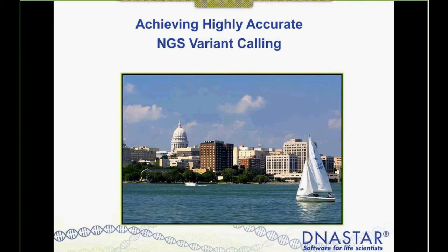As a starting point, though, I'll give some background to DNASTAR as a company, and then we'll go into kind of what the workflow is, and then we'll launch the software, and I'll show you how to set up one of the projects and do some of the downstream analysis.